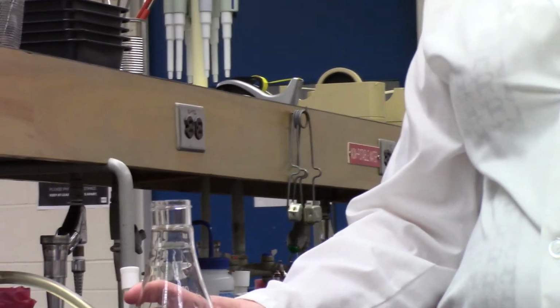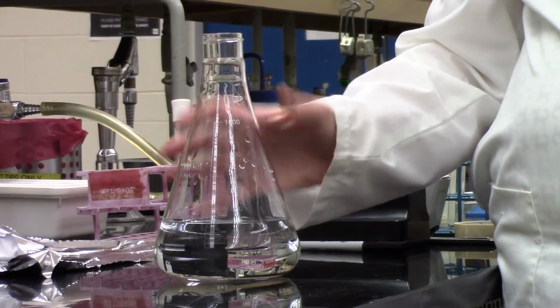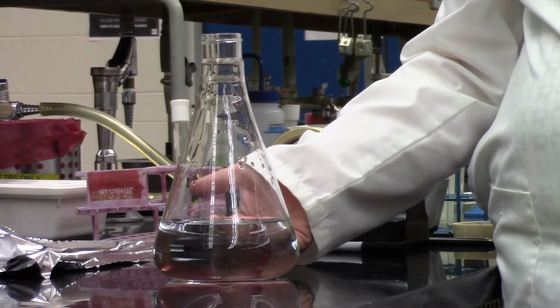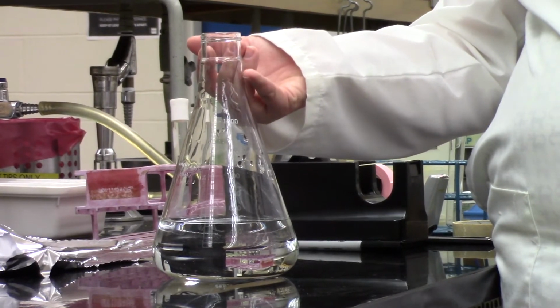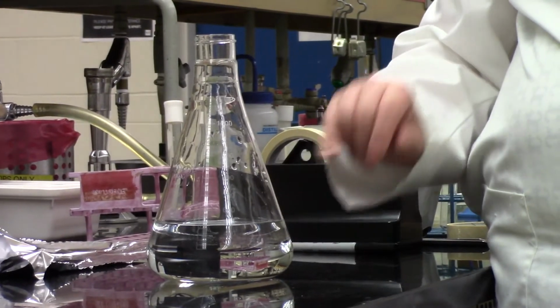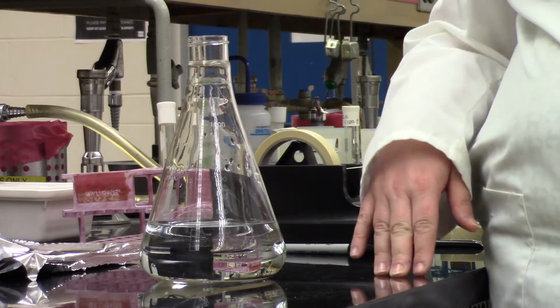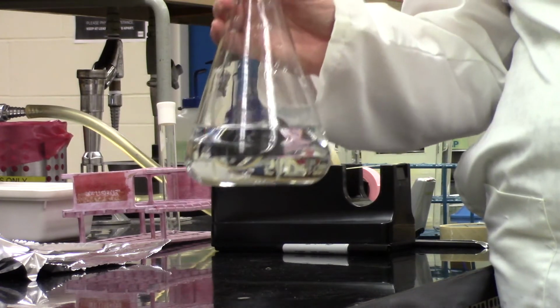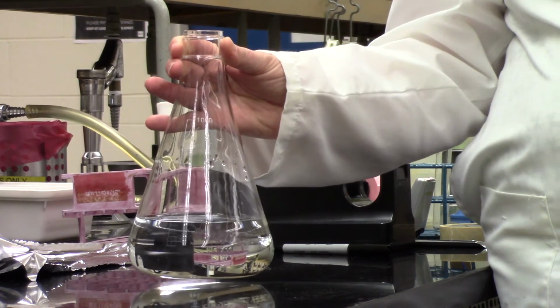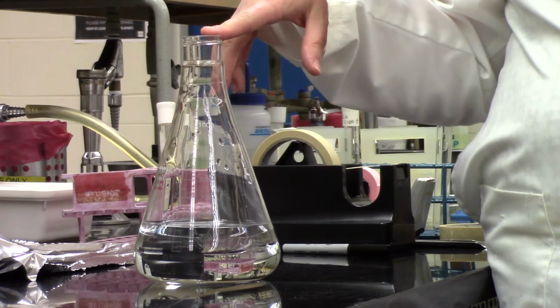The reason for that is that as this autoclaves, it's going to boil and bubble, and it's actually going to bubble quite a lot and get right up near the top. So if you've got any more than half in there, it would actually boil over. This flask as it is, even though it's filled appropriately, it's not ready to go in the autoclave just yet. And that's because it doesn't have a top on it.